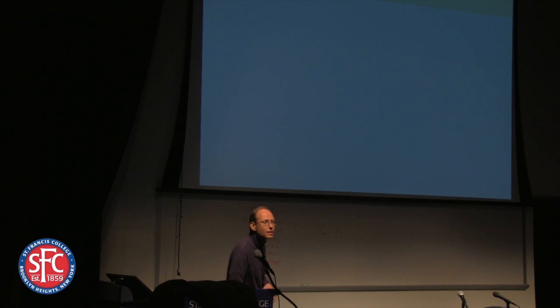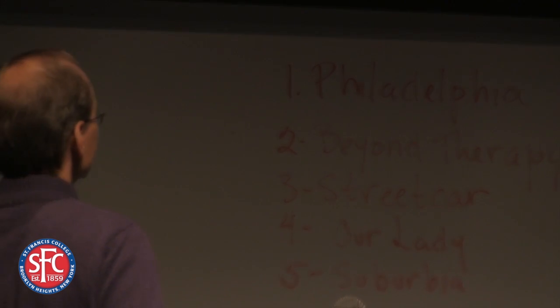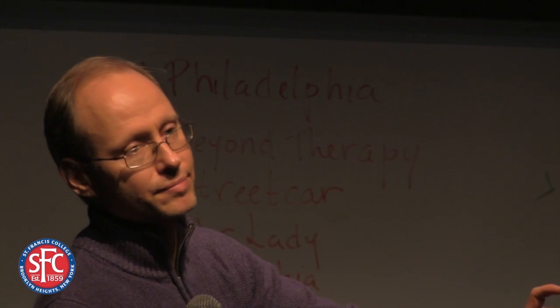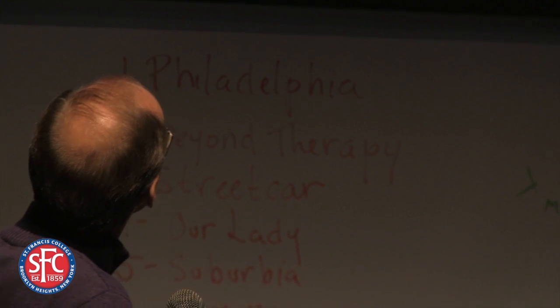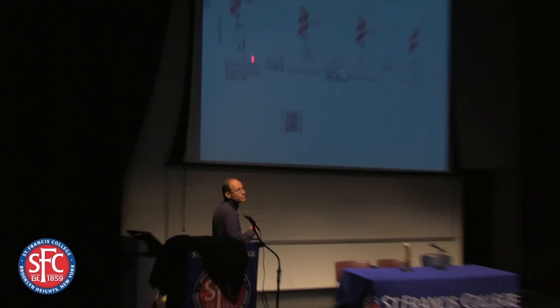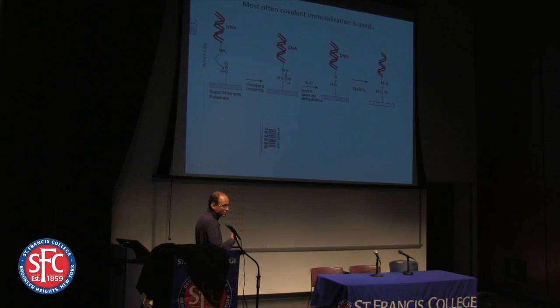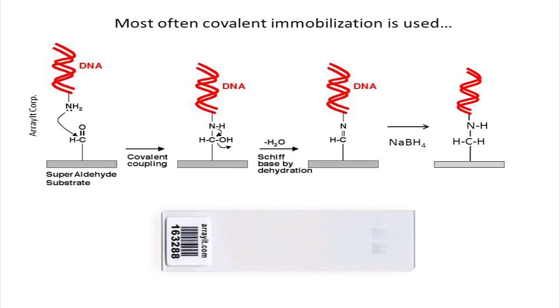How do you attach the probes onto the surface initially with your glass slide? You mean the aldehydes? The DNA, the nucleic acids. Yeah, that's a good question. It's actually somewhat involved, and I skipped some of the important steps here. In our case, we buy the DNA commercially with a terminal amine. The aldehyde slides you can also get commercially, but one has to be careful, because with certain manufacturers, the repeatability of their products in our hands has not been as good as with others.